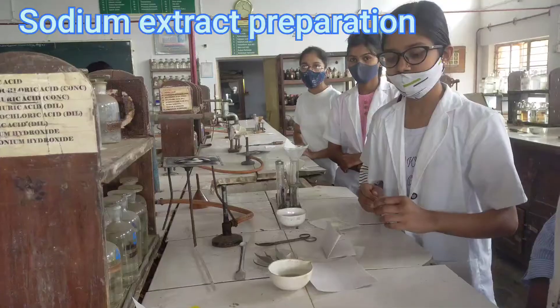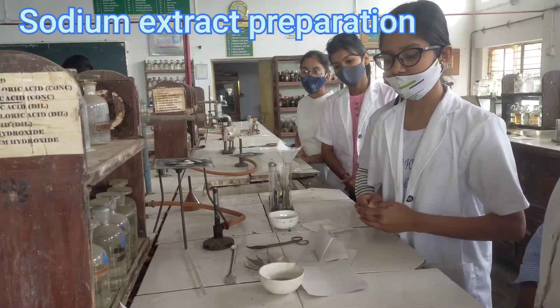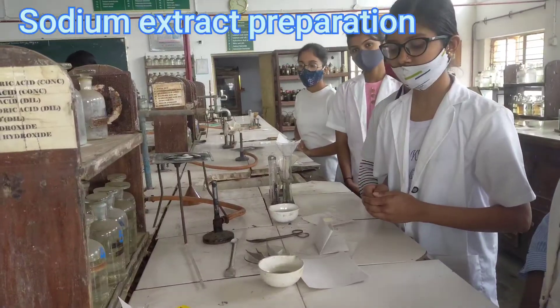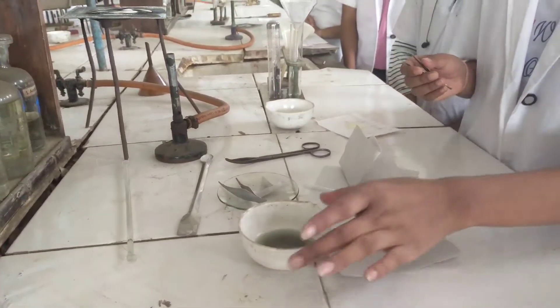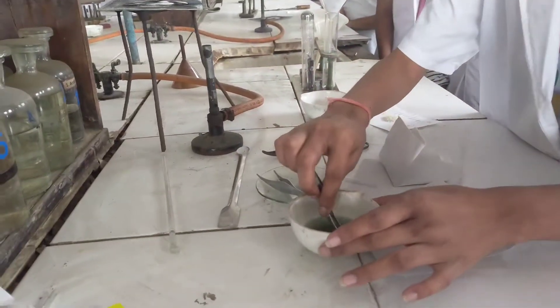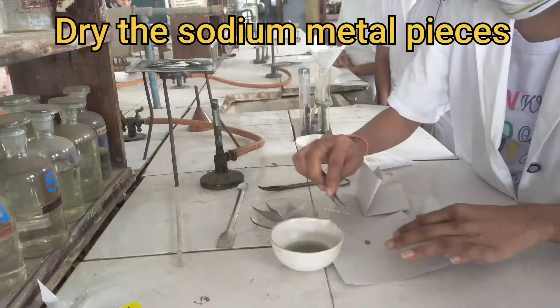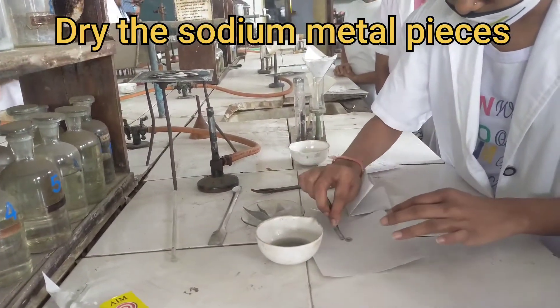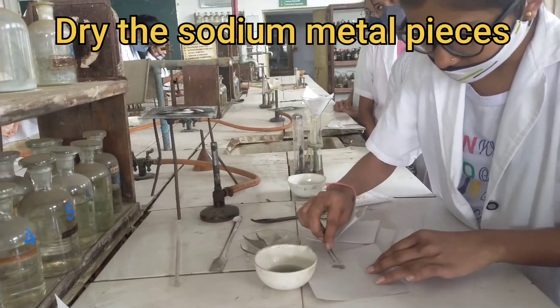Now, for the detection of the extra elements, we are going to prepare our sodium extract. For this, we need the sodium metal pieces, which are dipped in kerosene. Our first step is to dry the sodium metal pieces properly with the help of filter paper.